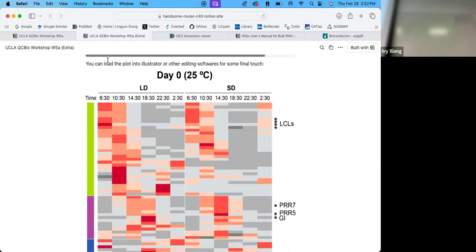If you have R, then maybe. Sometimes you can specify that as a batch file. The worst thing you can do is leave certain words and then not change them.